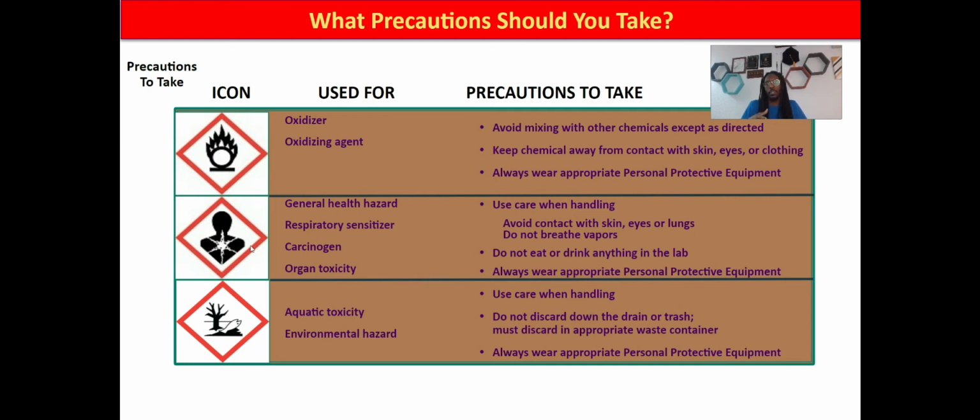Are you guys going to see this in this course at all? No. Okay, so you're not going to be working with dangerous chemicals like that. But like I said, you may use these outside of class. So you're going to have to use this with care when you're handling it. Like with all of them, you're avoiding skin, eyes, and lungs. Make sure also with these that you're not breathing in the vapors coming from the bottle. Of course, no eating or drinking in lab, and of course, wear that PPE.